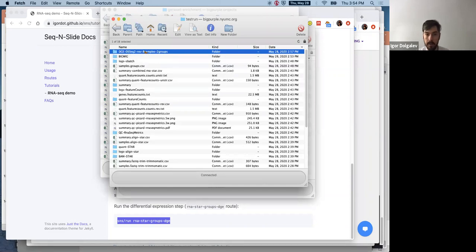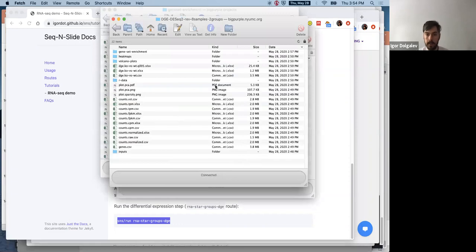So once you go there, there's a lot of different output. Unlike the primary analysis, where really all you need is to go from FASTQs to a table of counts, here there's a lot more that you can do, which is why next week is a whole week devoted to what you can do with DE-seq and how you can manipulate the inputs, the outputs, and the different steps. Here it's the default output where it gives you the normalized counts. So you start with the raw counts. You can open it in Excel.